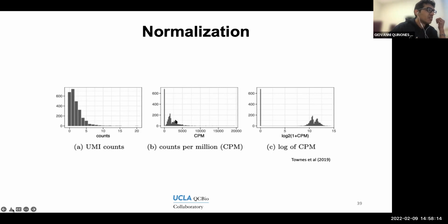And the question of how the zeros, meaning what fraction of your entries are zeros, what percentage of zeros is acceptable, and how the zeros will further influence downstream analysis, is also an ongoing question. It's pretty well known, of course, that, as we'll see later, the greater the amount of zeros, the less you can trust certain metrics.